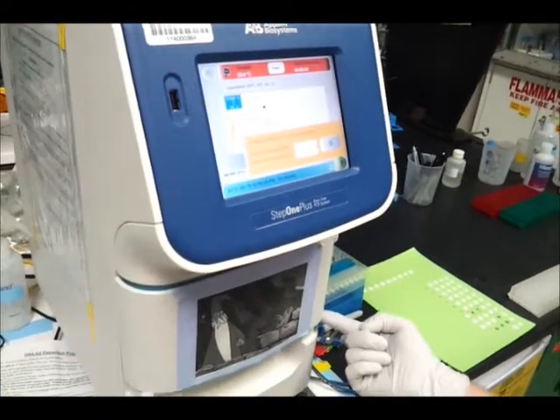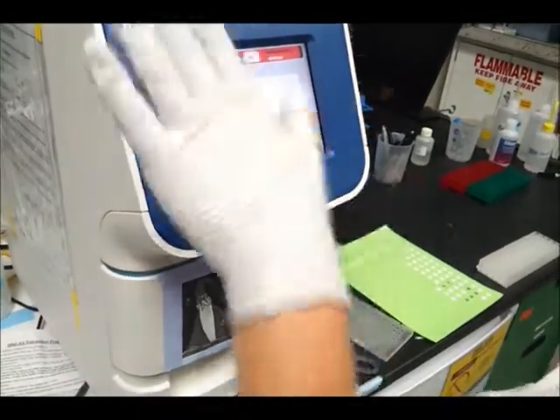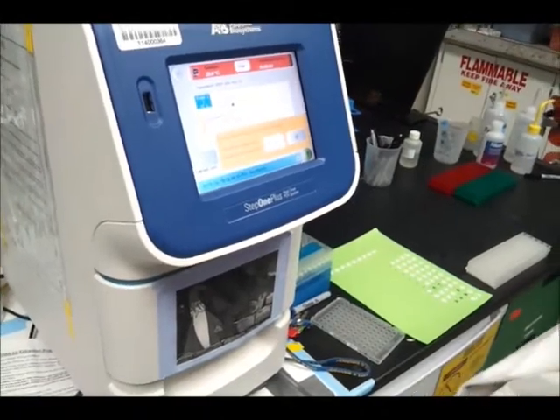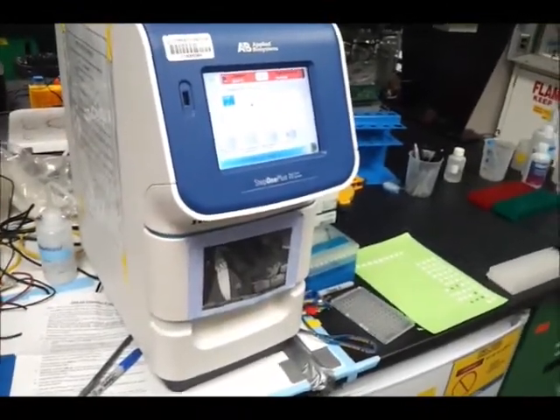And once this guy goes up, and you see that it says that the plate is heating up, and that the screen has lit up, and it shows that it's going through the process, that you know you're good. I would like it to say time remaining in a minute. I think it's getting to that point. Yeah, so it says it has an hour and 13 minutes remaining. So that is qPCR with Kate.